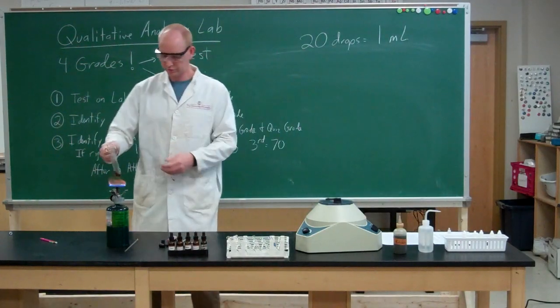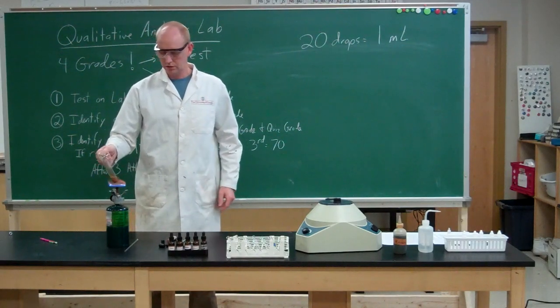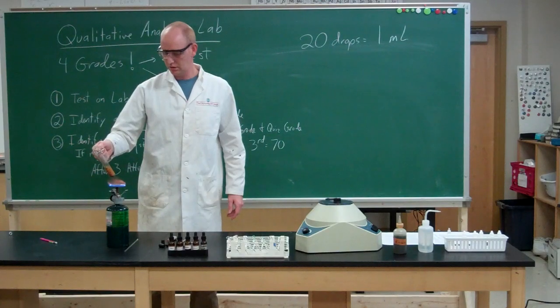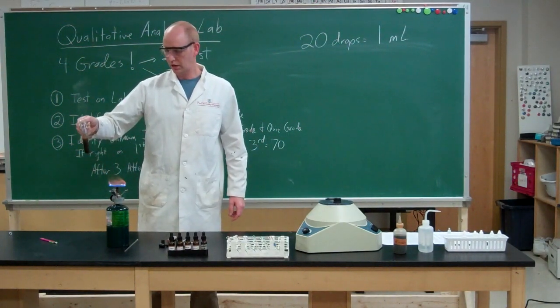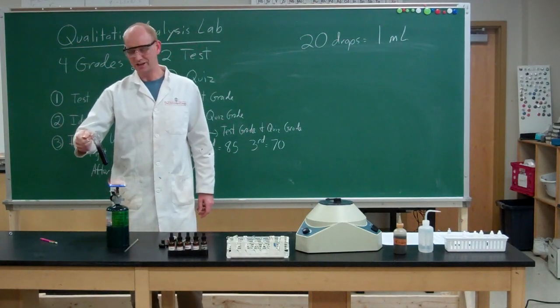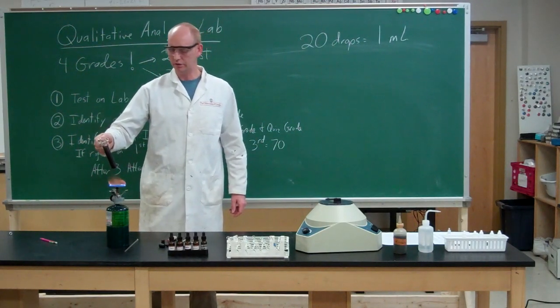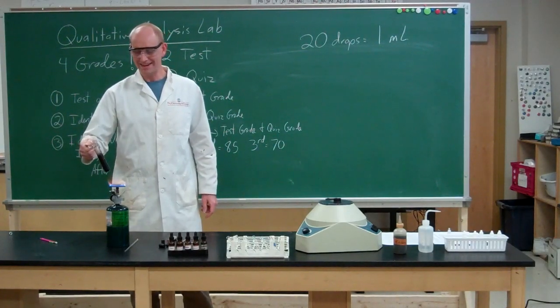And if you're curious, I'm going to heat it again. Sodium hydroxide is going to take the iron and form an iron hydroxide complex to it. And it's going to take the aluminum and form an aluminum hydroxide, an AlOH4 complex. And the hypochlorite is going to oxidize a chromium ion to a chromate ion.